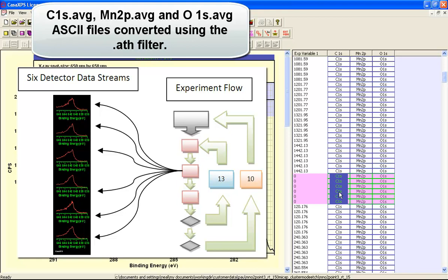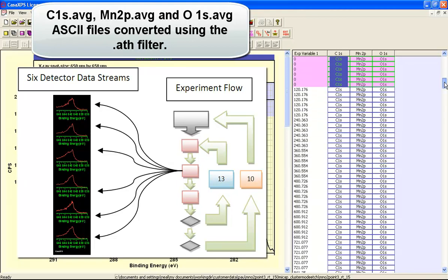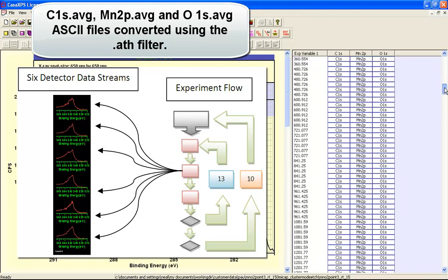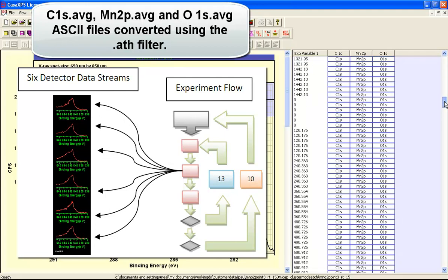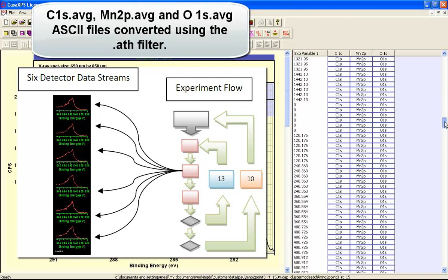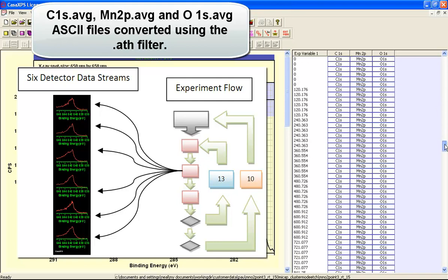So these are part of the iteration sequence. And there are ten of these. So scanning down the data file, you keep seeing zeros appearing again. And that's where the etch sequence has started afresh.